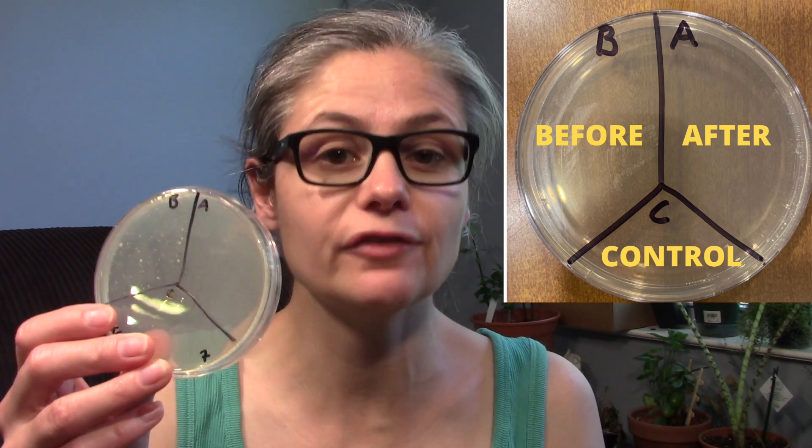Here's the deal — they just say squirt under the bowl rim, brush the bowl, then flush. I'm going to give it a 5-minute wait time, just because that seems to be pretty standard among other toilet bowl cleaners, and since I'm going to be testing it against my other cleaners, that's what I'm going to do. I'm going to squirt it around the rim, let it sit for 5 minutes, brush, flush, resample it, and put that sample on the Petri dish section A for after.